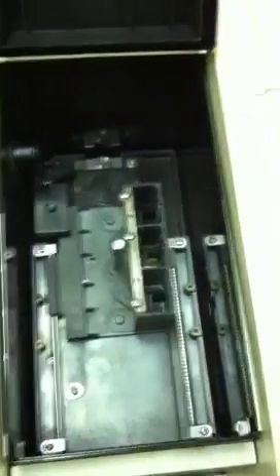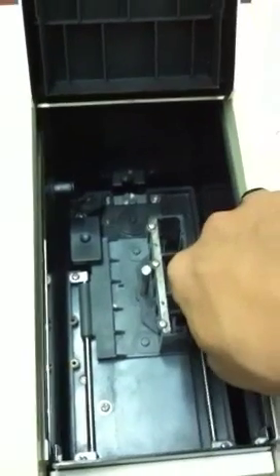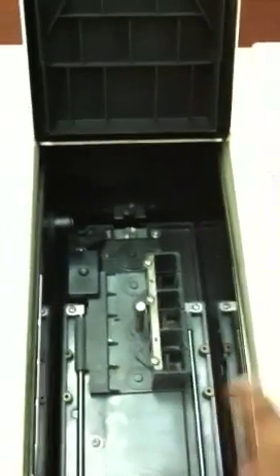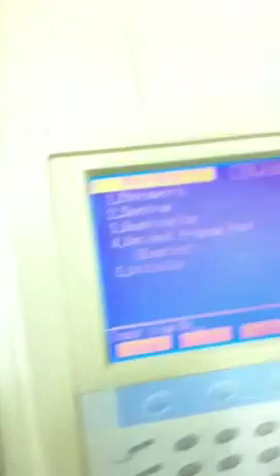A 6-cell sample compartment, and it's automatic. You select the sample number from the main screen and then it gets to that particular sample. Just put the blank and then the sample, select it from the screen and it will just change it by itself.